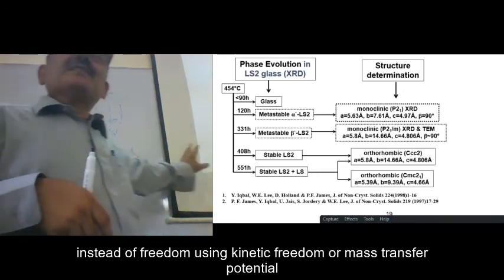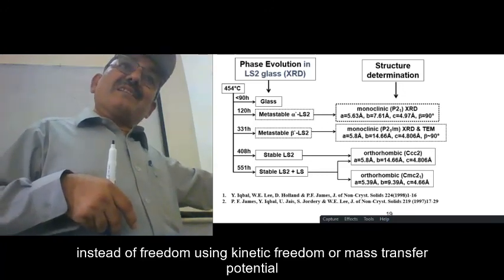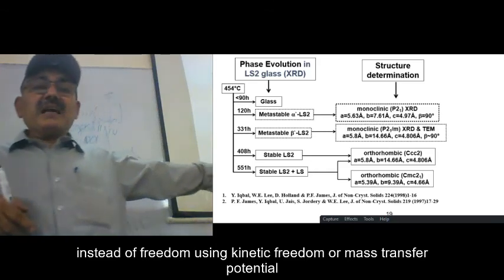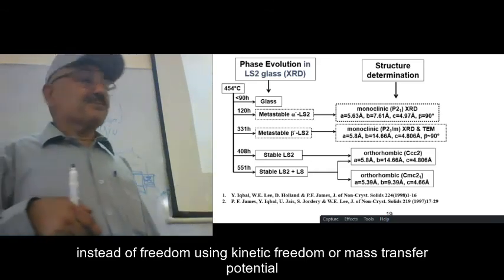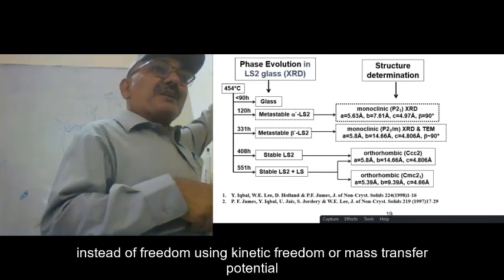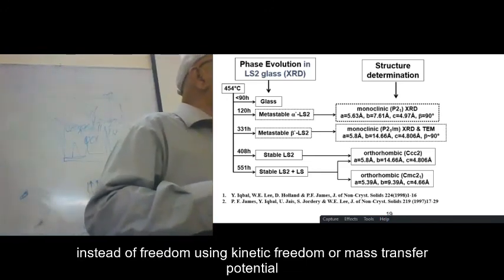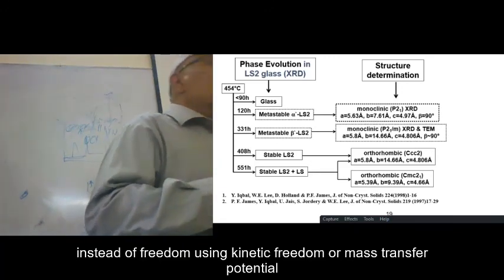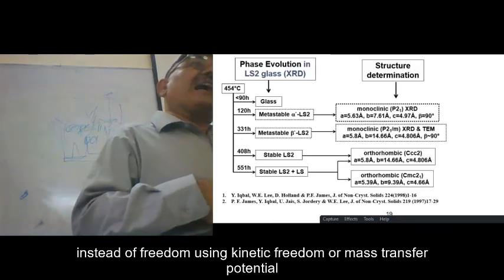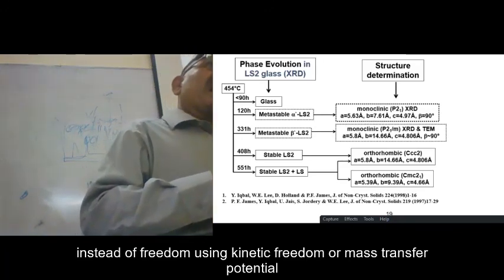So powder is the best way for phase analysis and crystal structure analysis. Now, I was telling you that I heated it for 90 hours, not for 1 hour, 2 hours, 3 hours, 4 hours, but 90 hours, to make sure that there is not enough kinetic freedom inside the material to crystallize.